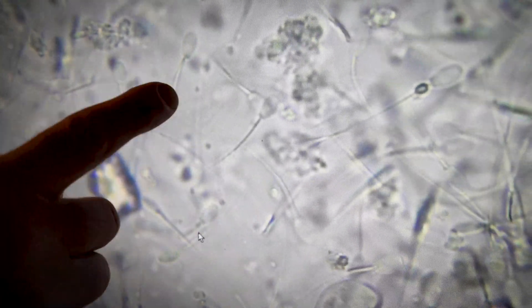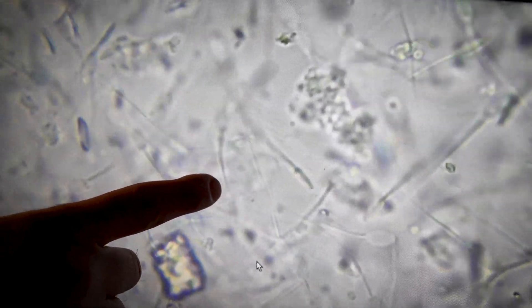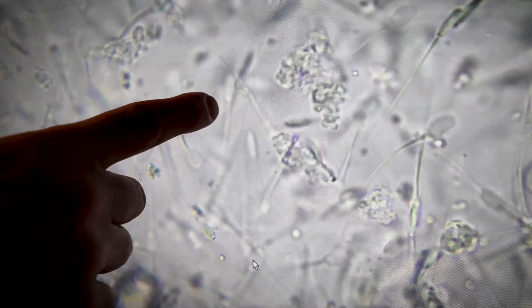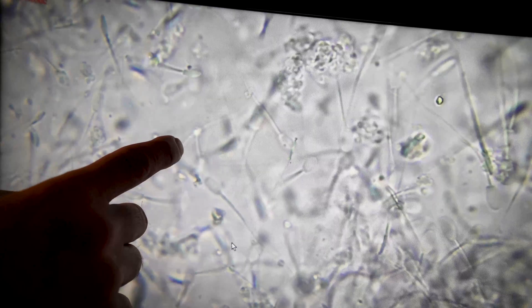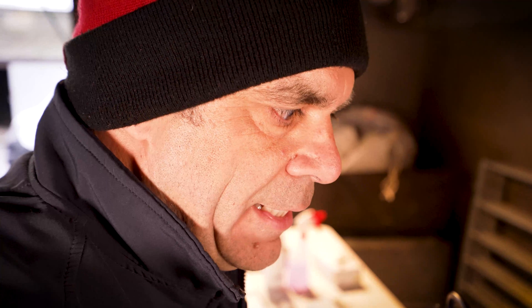Ideally they should all look like that but with a lot more movement — head, mid piece, and a nice tail. This one is on its verge of finishing, dying. There's another one that's dead now because it's an hour after we collected it. But there are an awful lot that are still moving, and there aren't that many with problems of shape.